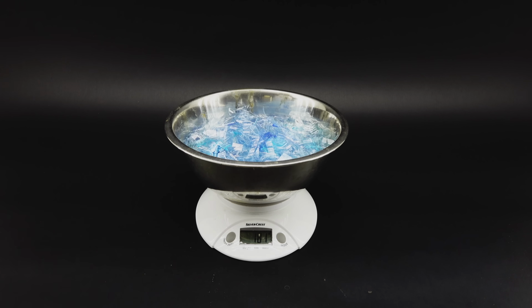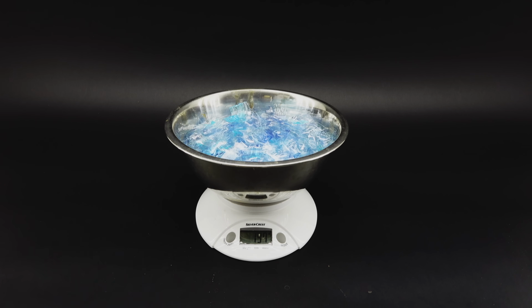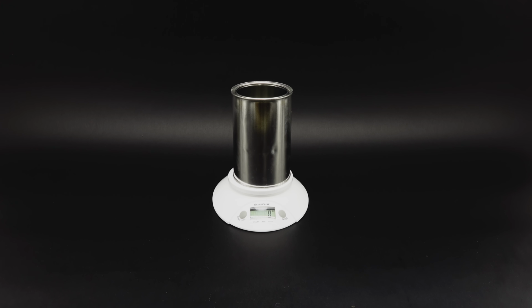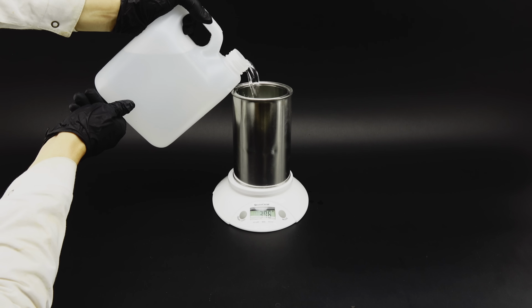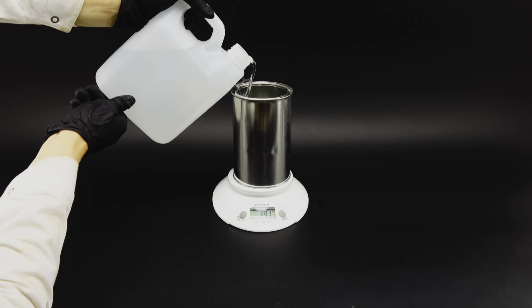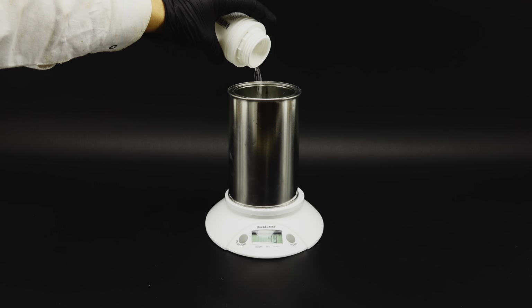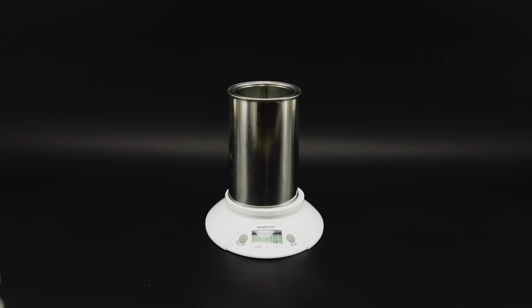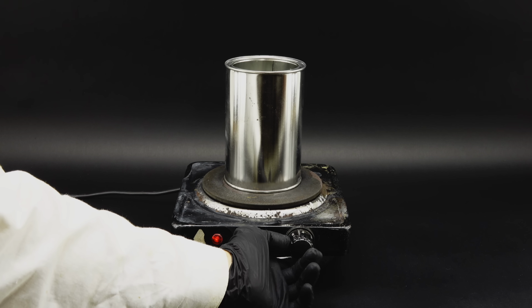Anyway, with all the reagents resupplied and the setup fixed, I was now ready to run this reaction one more time. I began by weighing out the ingredients, and this time I wanted to have some more solvent around, so I used the roughly 220 grams of my remaining ethylene glycol along with nearly the same amount of the commercial stuff. This should make the solution less boiling prone, and as the second ingredient I again used 100 grams of sodium hydroxide. I got the resulting mixture onto my stove and this time started heating it right away.